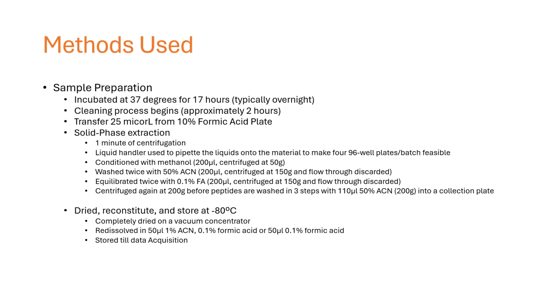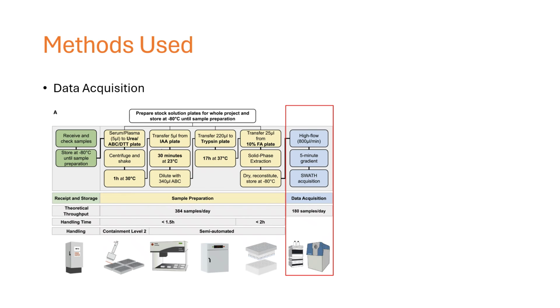They're then completely dried on a vacuum concentrator and redissolved into solution, and then they're stored at -80 degrees until it's time for data acquisition. And here we see the data acquisition step.